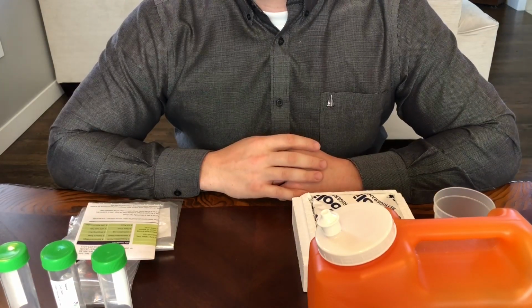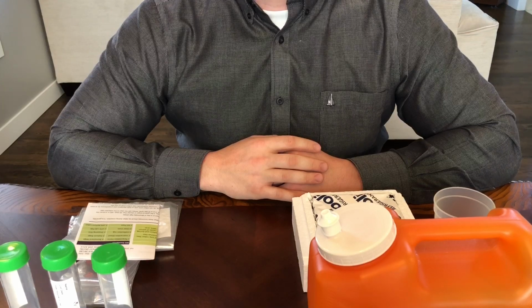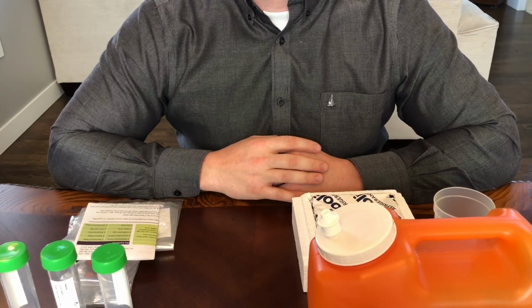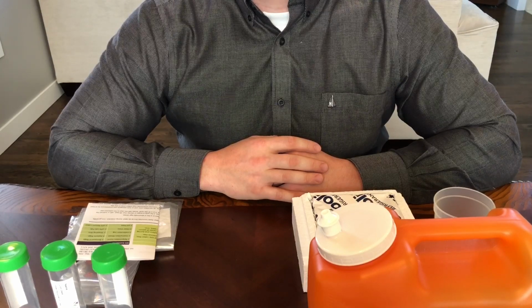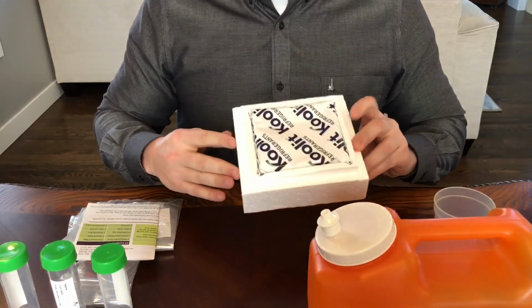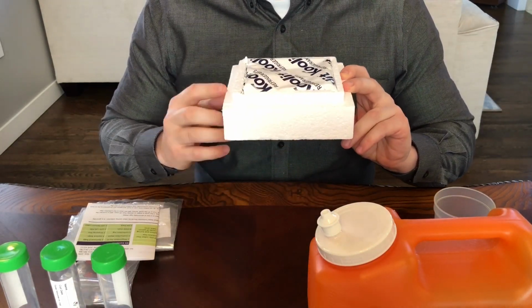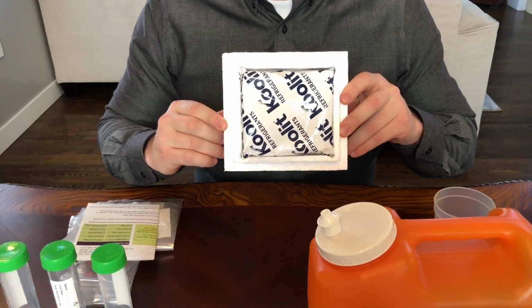Make sure to fill out all of your information on the requisition form provided to you by your physician and identify the specific 24-hour urine panel you want ran. Also, please make sure to fill out your hormone symptom questionnaire. Before collecting, place the provided ice pack with styrofoam lid into the freezer as you see here.